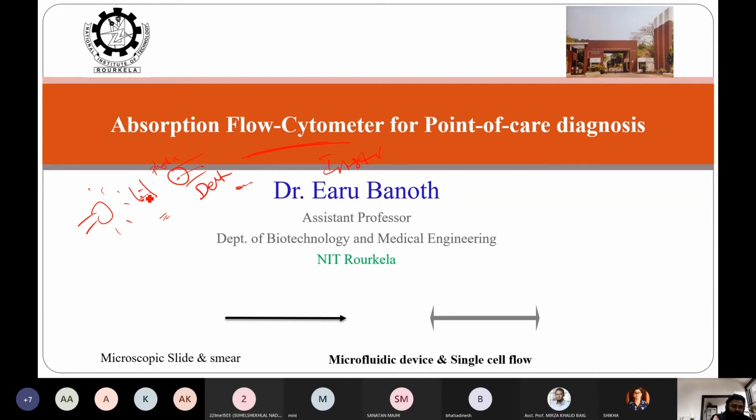The amount of loss we are seeing here may be due to the sample absorption, right? Or various other things like the ambient surroundings causing light loss. Maybe it is scatter information also.